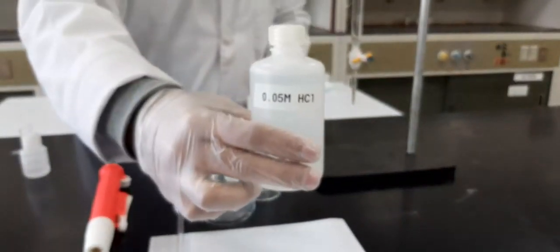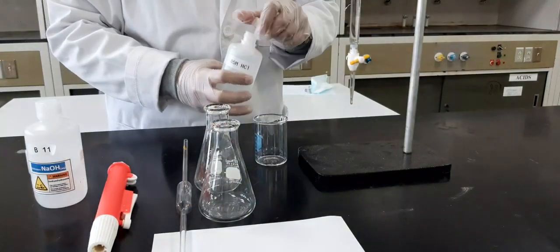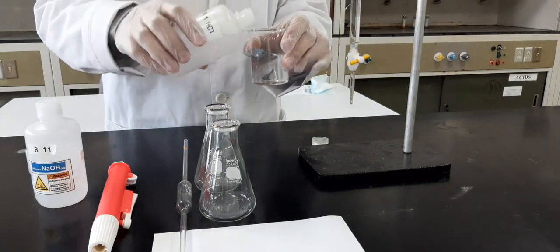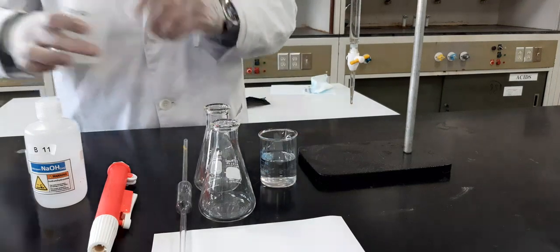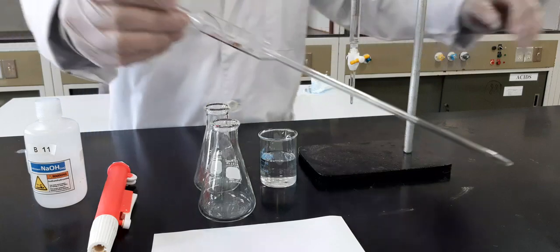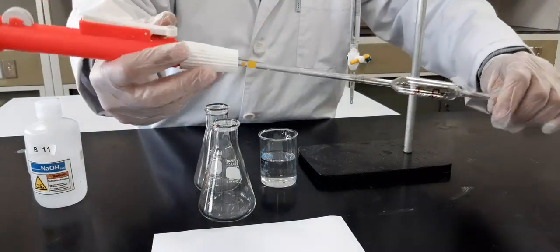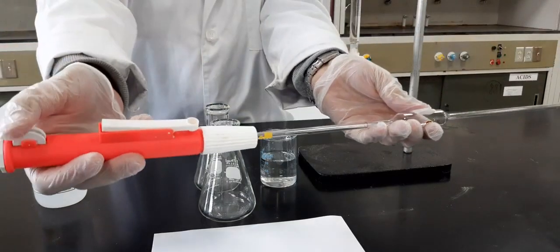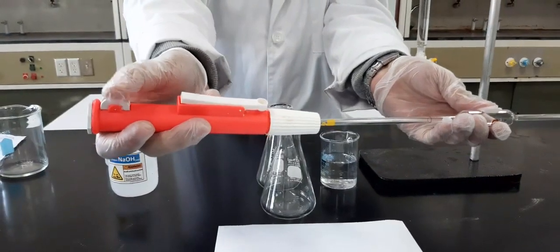The acid solution is the known one, 0.05 molar. I should take the acid solution first into the beaker. And then from here I will take, with the help of the pipette, 20 ml in each of the conical flasks. So let's see how to use this. This is the pipette, and this is the pipette filler. We should not push it too hard. We should hold it with 2 hands like this. Now we will scroll it. When we scroll it down, it will take the volume. When we reverse it, it will deliver the solution.